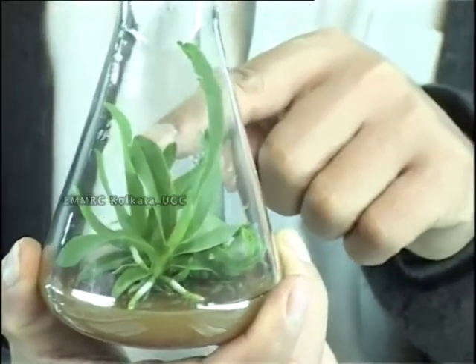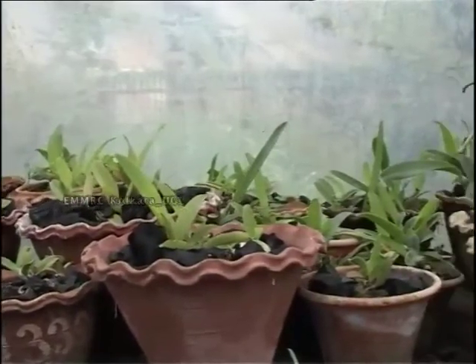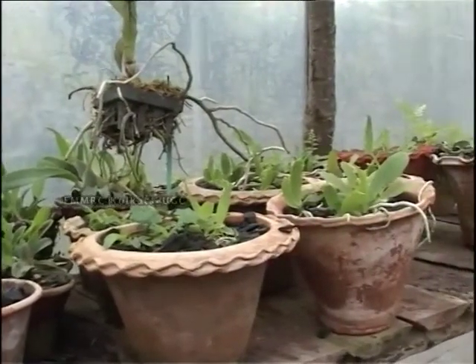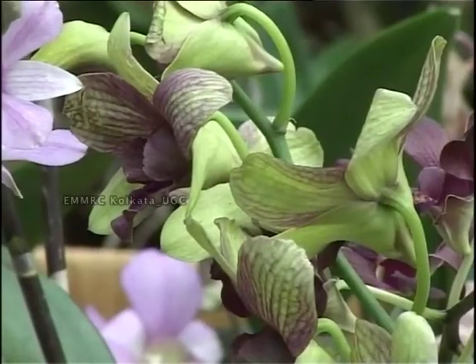This orchid is ready to be transferred to the pot. Depending on the species, some plants are planted straight into the pot, but others need special attention because they are very delicate.